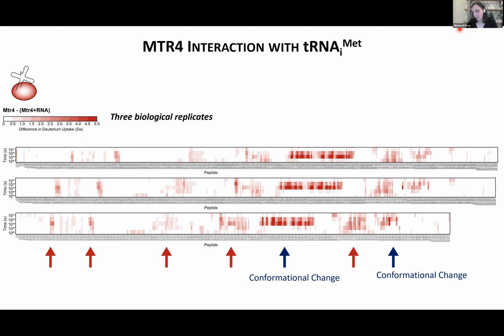And I hope you can absolutely see, even though we have slightly different peptides that we recover because of various reasons, that the pattern that we're seeing is 100% reproducible between these replicates. That's just a take-home message I wanted to send, because I'm not sure why so many people question the reproducibility of HDX. But let's look at the actual result that we got.